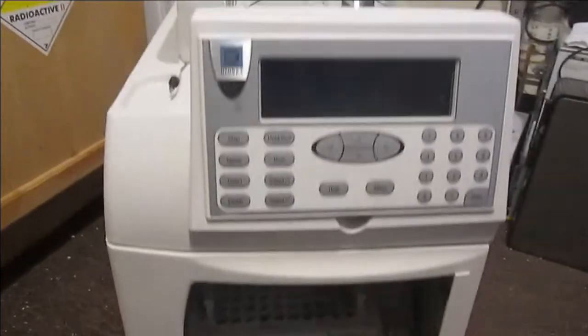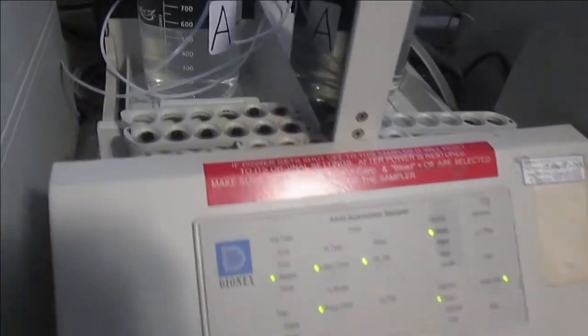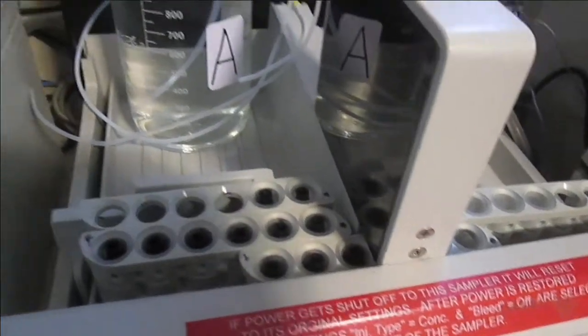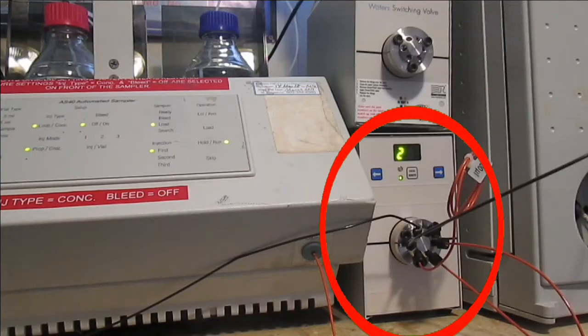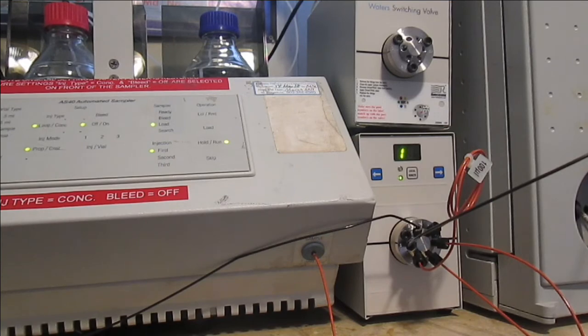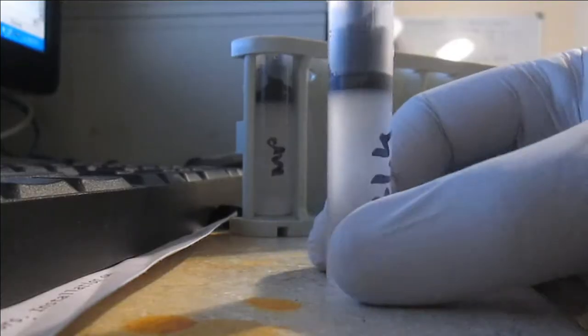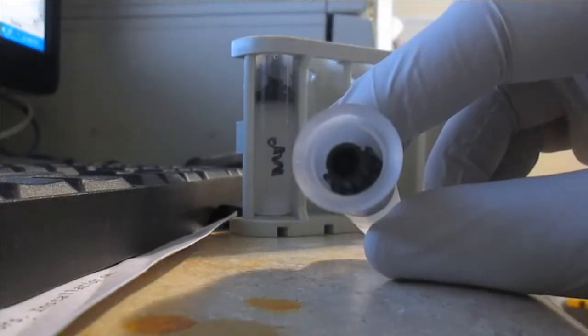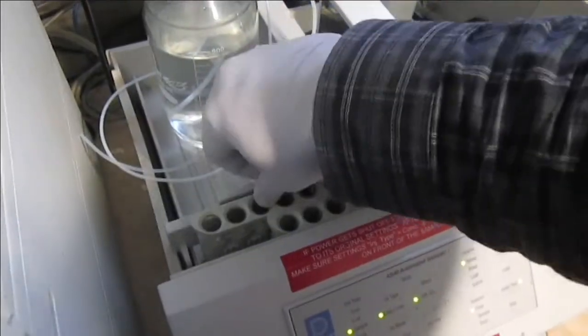But first, I replaced my autosampler with a more appropriate one, as the older one did not inject sample correctly. It was not suited for ion analysis. I've also installed this new valve, which injects the samples to be analyzed in a very consistent and reproducible way. Now the sample goes into these plastic vials, which are protected by a filtered cap. Each one of the samples is then lined up for injection according to the sequence set up in the computer program.